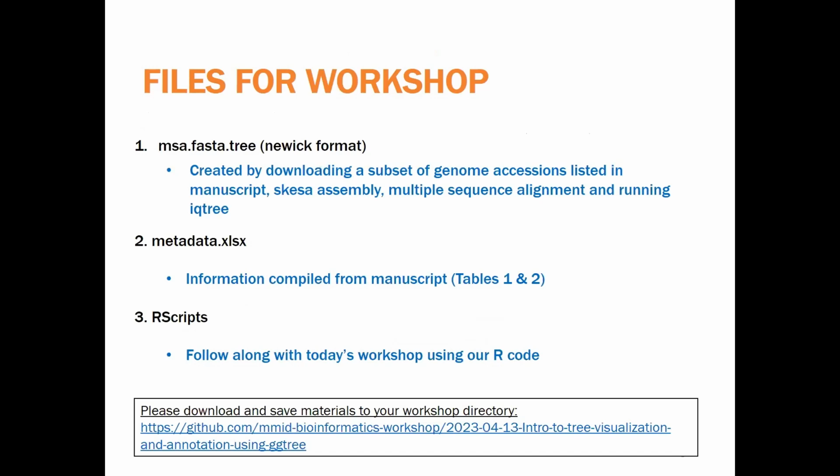The files for today's workshop include a tree file that's in Newick format. This is what we created if you were here for last week's workshop by running IQtree. If not, it's still available to download. There is a metadata file in Excel format, and it includes compiled information from the manuscript we're working from. And then there's 2 R scripts available.